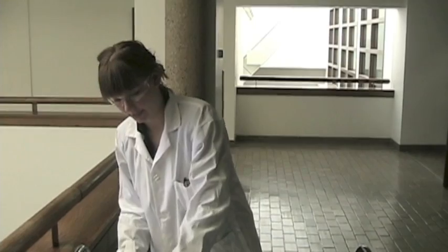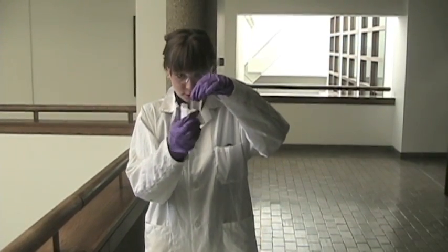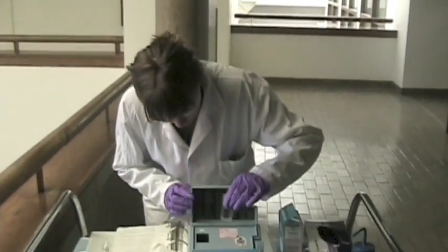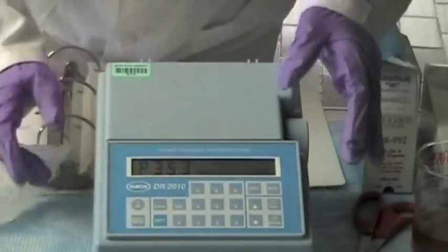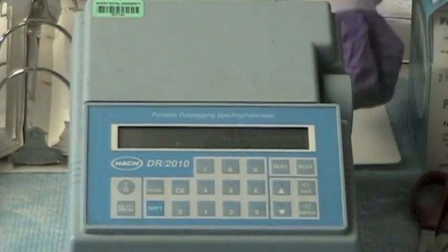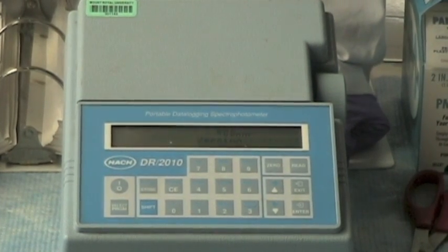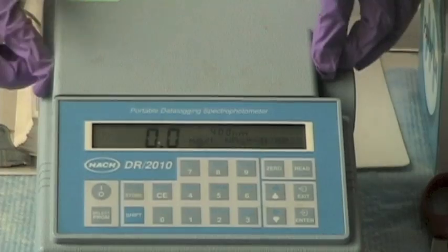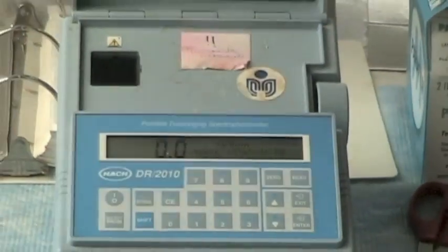Zero the machine to the blank. Clean off any residue or fingerprints from the cuvette, noting the spacing of the marking line and lining it up in the machine, then zero. Now place the sample in to read.